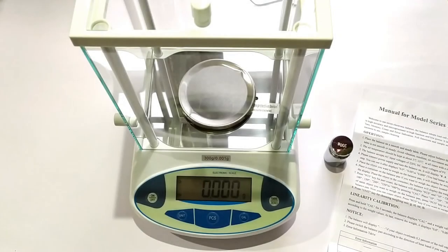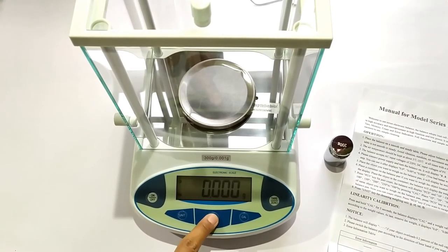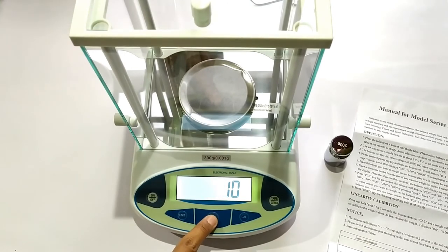This device like many other digital weighing scales also includes a dedicated button for piece counting operations. To use this function on the device, we simply press the PCS button. And the number 10 starts blinking in the screen.